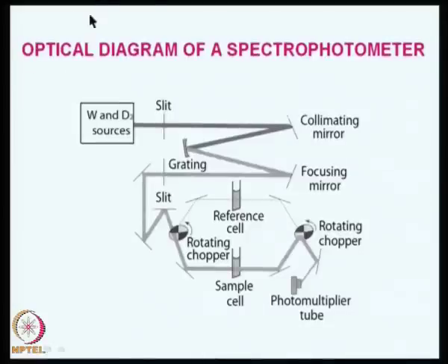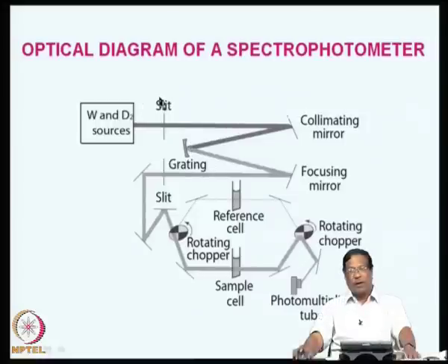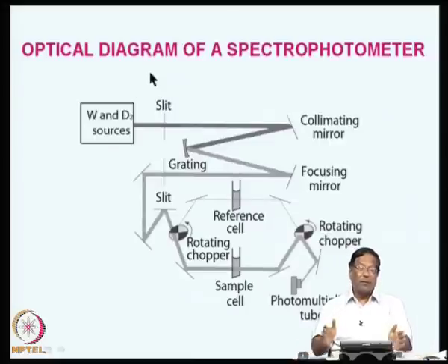Here you can see the optical diagram of a spectrophotometer. Here we have a tungsten and deuterium lamp, slit, and then collimating mirror, grating, and then focusing mirror, and you can see that a number of mirrors are there: 1, 2, 3, 4, 5, 6, 7, 8, eight mirrors in this figure. All these things are necessary to keep the size of the spectrophotometer very compact. Earlier, Russian instruments used to come, which would be about the size of a big table, and nowadays small tabletop models, carry models, field models, are all available.